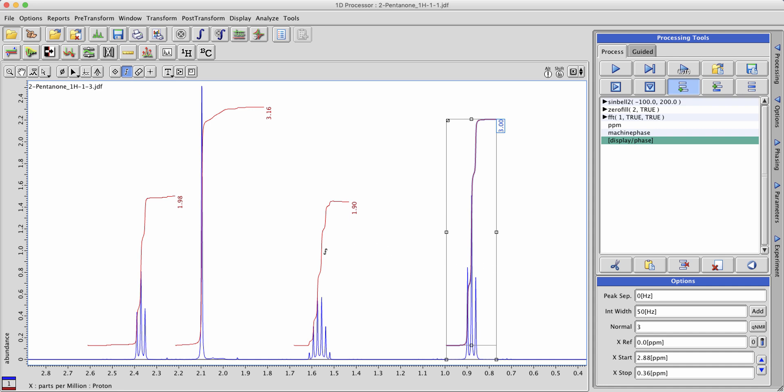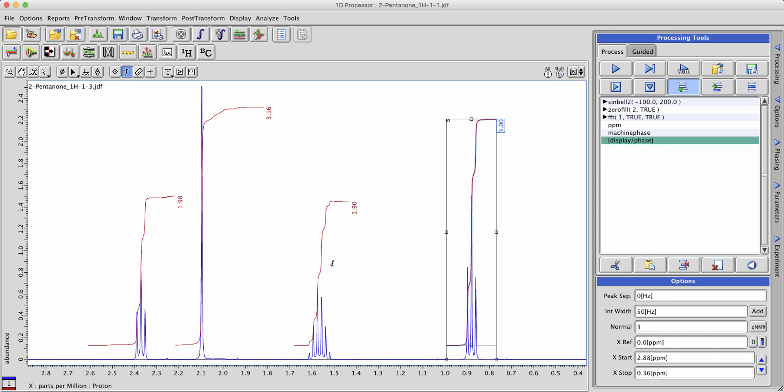Alternatively one could normalize multiple peaks to a certain value. Say this quartet or this methylene and this triplet.